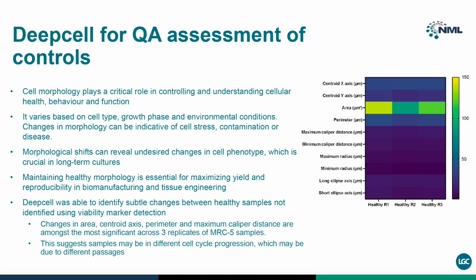So in short, morphological profiling is not just a diagnostic tool, it's a strategic asset in biomanufacturing, as it helps us move beyond the traditional viability assays and towards a more real-time understanding of cell health and functioning. So what I wanted to show you here is the ability of DeepCell as a tool to be used as a quality assurance assessment of controls.